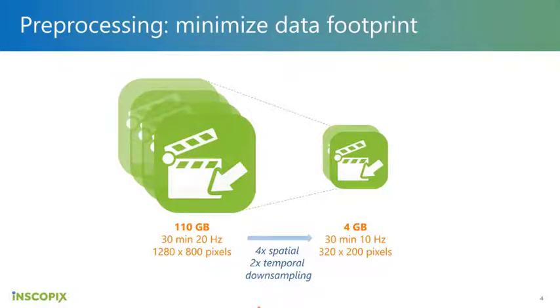No, I mean, sometimes they just want to export as a TIFF for some reason and then re-import the file in IDPS. In that case, how do you get the TIFF? You record it in TIFF format? No, I mean, they record in ISXD, but then in IDPS, they basically export the processed data, or the processed recording, in TIFF.